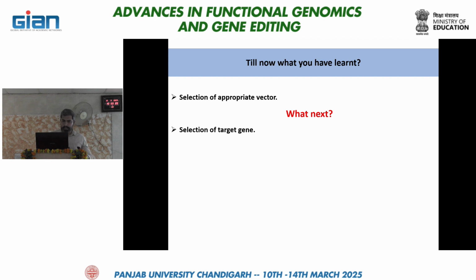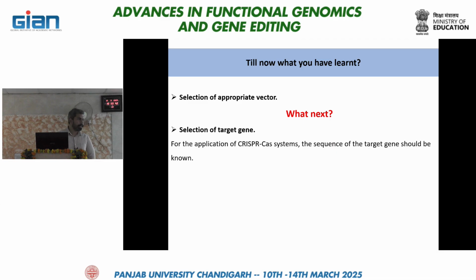So what's next? The next is the selection of the target gene, because you want to target a particular gene which is going to have a particular function in either plant or animal, whatever you are targeting. For this, the sequence for that target gene should be known, because otherwise you would have to get it sequenced, and you have to know the legit sequence for it based on homology.